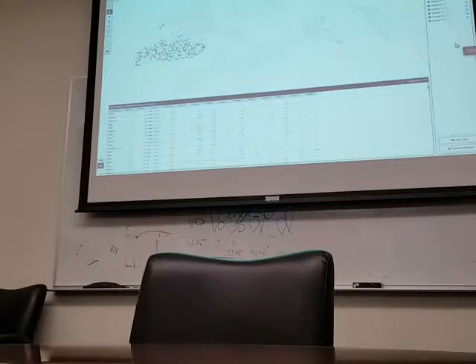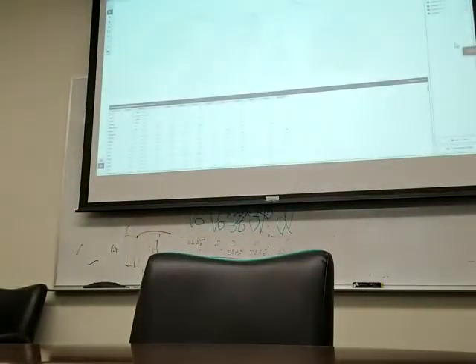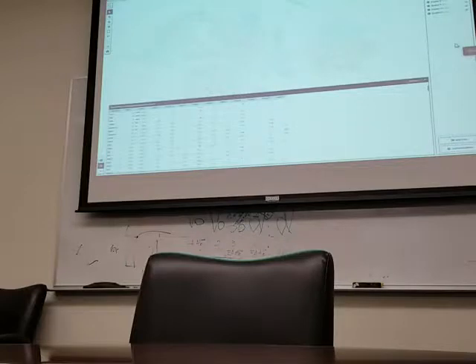Hey, Chris, I have a question. Can you go back to the 3' example? Yeah, this is the background. Is that all 5', by the way? All 5' samples put together? The one that we were just looking at was the 5'. And these are the 3'. And there were like, I forget, 12 clusters when you put all the 5' together, and the normal was in one place, I forgot what it was, but even something as beginning as this is pretty nice.